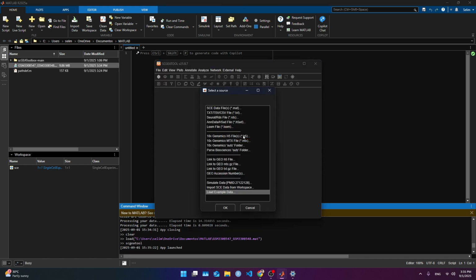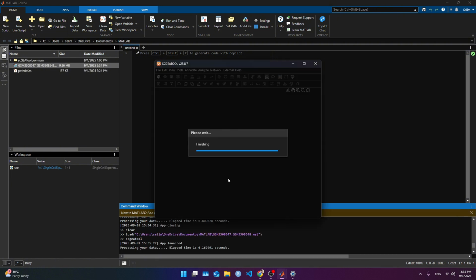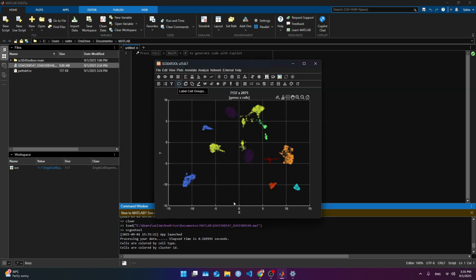and then import data. Then I want to look for a MATLAB file. Hey, where is that? Over here. Click on it and it should have all my process already. Cell types. Great. We look for cluster IDs. Great. So far, so good. This is how we process the samples, and later on we're gonna work in different ways to further refine this process.